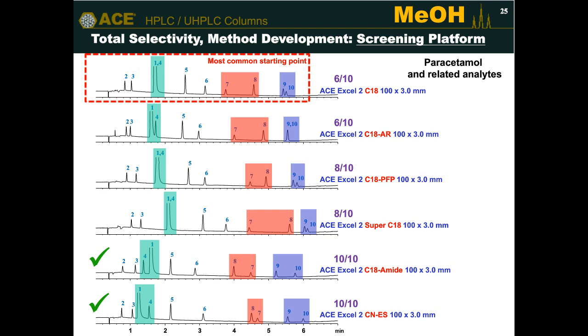So we would have needed to do further method development, further injections, tweaking the gradient, tweaking the temperature, whatever it is you do for your method development to try and get full separation of all 10 compounds from each other. Whereas with this simple screen, using chemistry to maximize the selectivity, you can see we have 2 options for full separation. So that's the first 6 chromatograms.